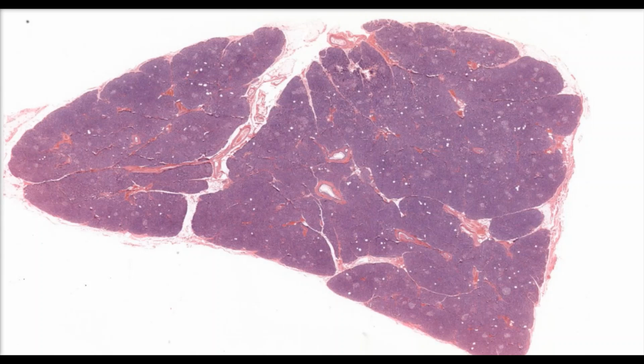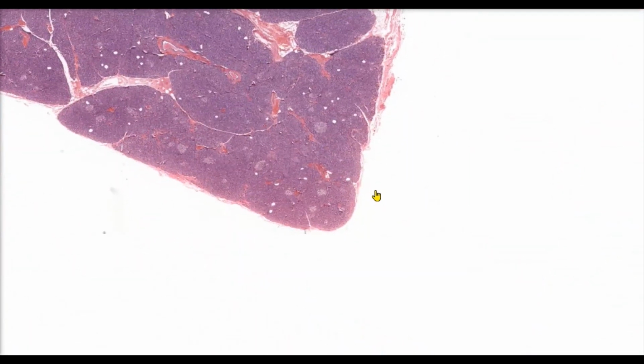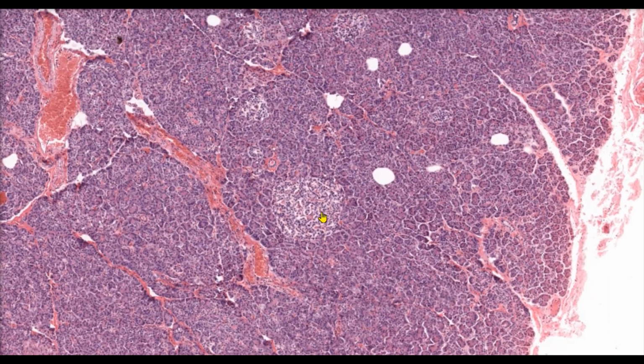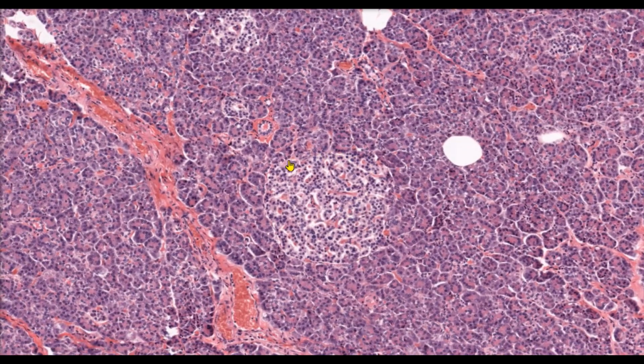Let's zoom in on the pancreas so that we can see one of these pancreatic islets. And as we look, we can see them all here. I'm going to zoom in down on this part of the slide because we have a really big one right here. So let's zoom in down right towards this target. So as we zoom in, we can see our pancreatic islet here.